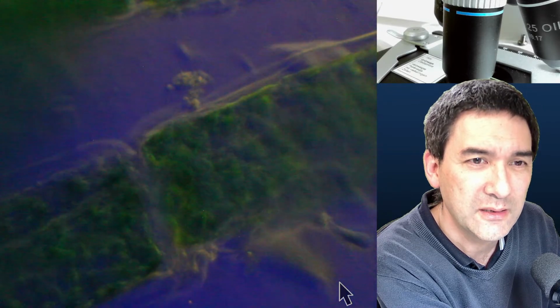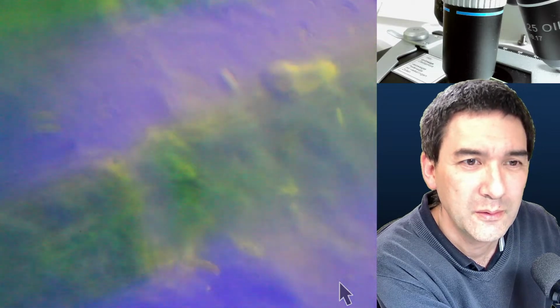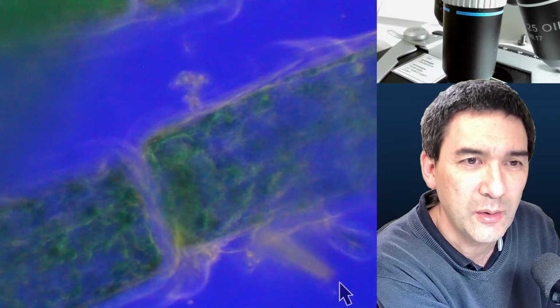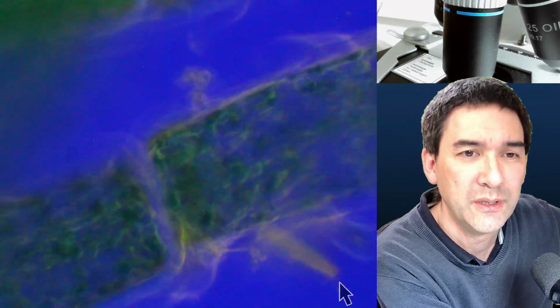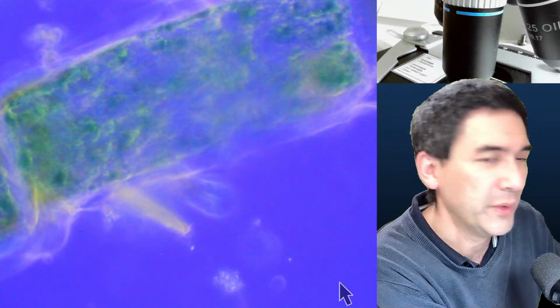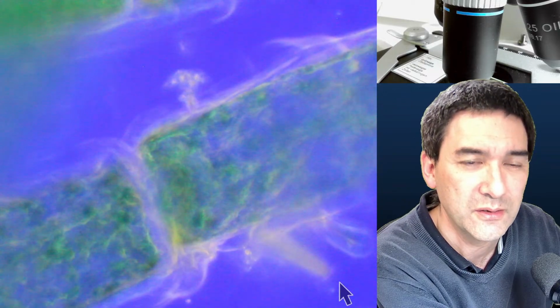So exactly. You see that this is already getting delicate. Now I've got again the blue background, but you see that everything becomes darker. So I'm going to adjust the camera now. I'm going to go up with the exposure time. And of course, going yet higher with the oil immersion or so, that's something that would probably not produce any decent result.